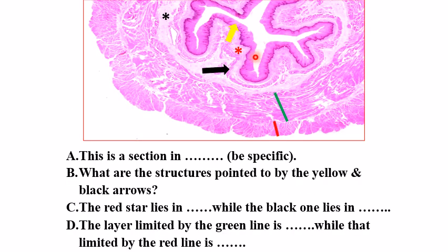Here, dear students, a large round structure with a lumen. The lining epithelium is non-keratinized stratified squamous epithelium, so it is esophagus. Dog or cat? Look between the epithelium and the muscle layer. There is no gland, but there is a well-developed muscularis mucosa, so it is esophagus, cat.